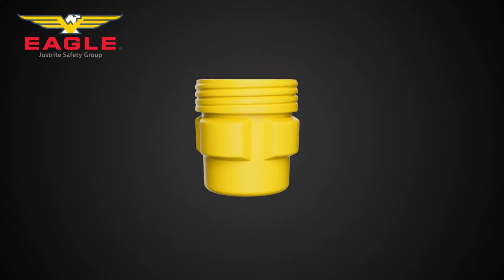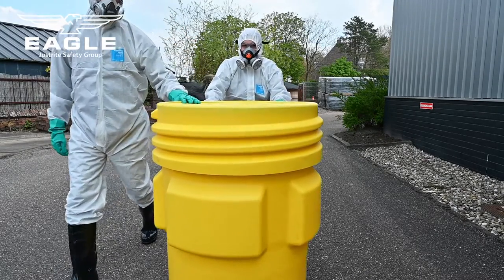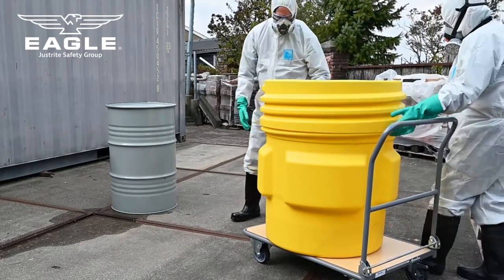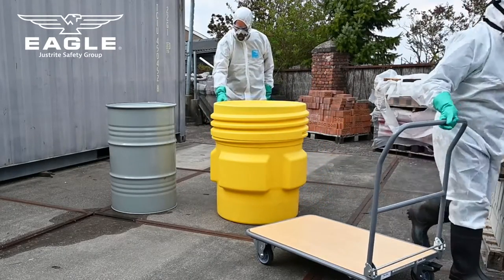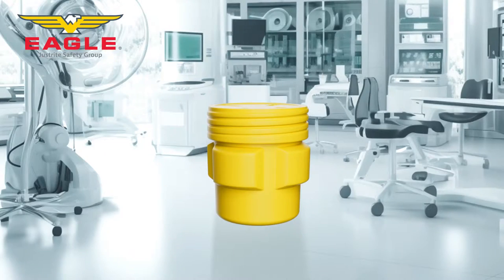Overpack and lab pack poly drums from Eagle are containers used for transporting and storing hazardous materials. These drums are designed to provide an additional layer of protection to the contents and prevent any spillage or leakage. These multifunctional poly drums can be used in a variety of industries such as chemical, pharmaceutical, and oil and gas.